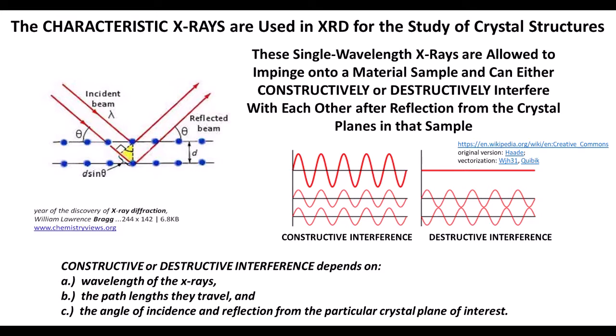This is not accurate in terms of the true physics, but it's a helpful way to schematically illustrate the behavior. However, X-ray diffraction is truly a diffraction or scattering phenomena that is fully three-dimensional. It is much more complex than the simple reflection model that we schematically use to illustrate the process.